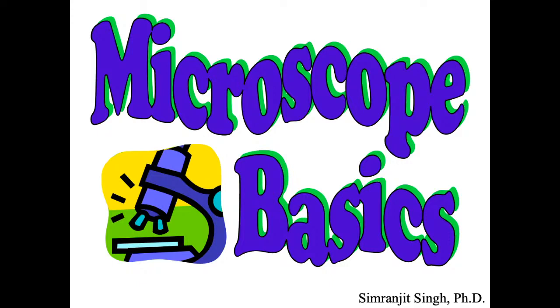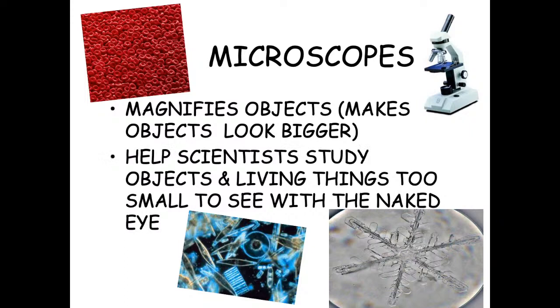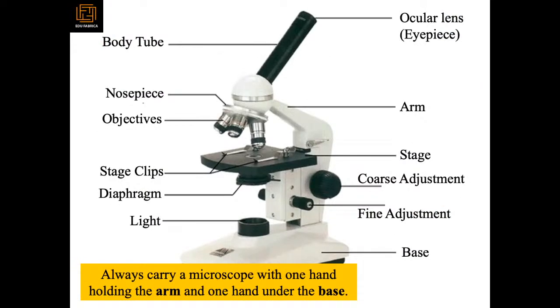But I just want to show you what the basic microscope looks like that we tend to use in our 12th class biology laboratory practicals. We used to go there and see fixed slides from pteridophytes or mitosis. So basically, microscopes are used to magnify objects which we cannot see with our naked eye, and which help scientists to see how things actually work and what the real shape is in real life, in live imaging.